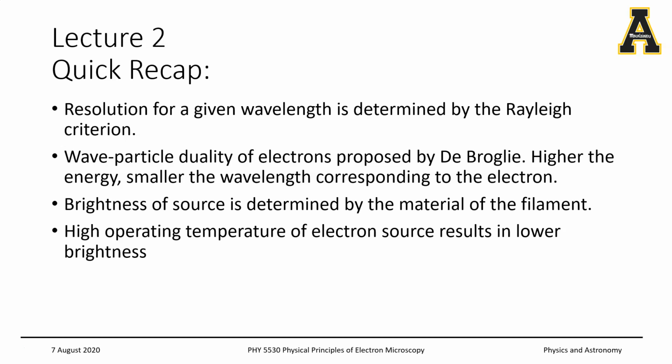We learned the concept of resolution, which is the minimum distance between two objects that you can see clearly. And we also realized that that is dependent on the wavelength of the light itself. So optical microscopes, which rely on the visible wavelength ranges, are unable to resolve below 300 nanometers, and that is laid out by the Rayleigh criterion.